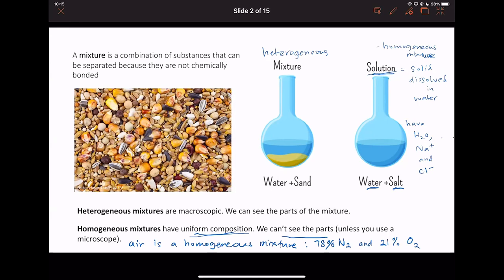Tap water, there's a lot of different compounds in tap water. None of them is dangerous. We'll get to that in module 8. But tap water, we know, is a mixture of a lot of compounds and ions. And then the pen inks. So we can test and separate out the different components in a mixture in a chromatography experiment.